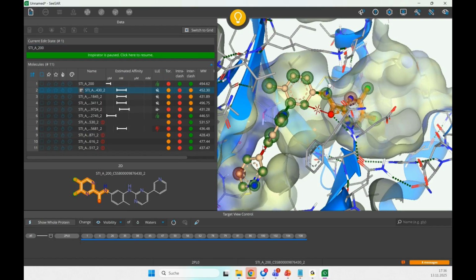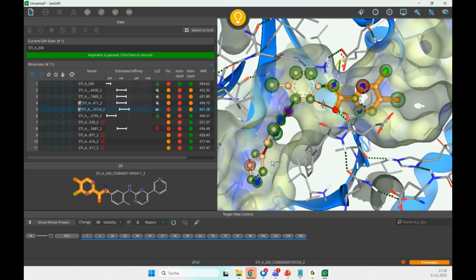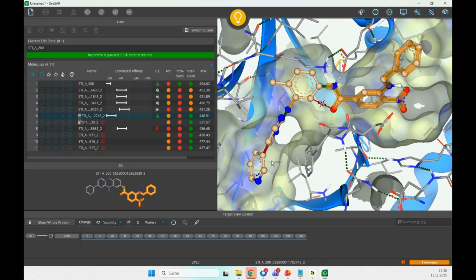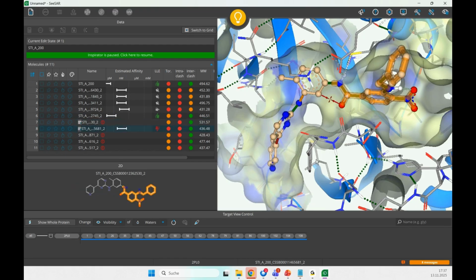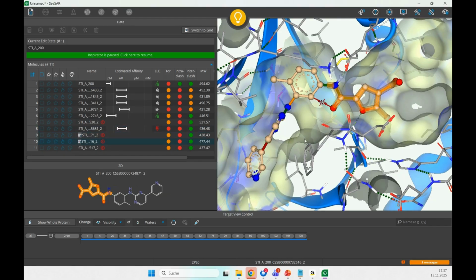Maybe this time in this direction. And there we go. More results.